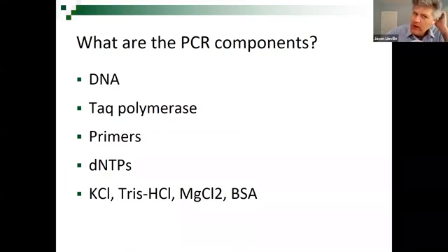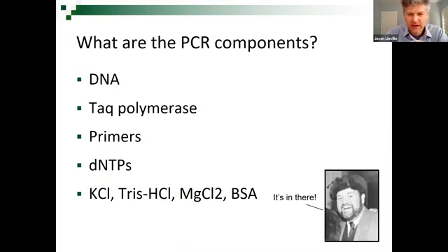So we already went over a couple of these slides right before spring break in this class. We went over what the 4 PCR components are, and then I mentioned with this slide, there's also a couple extra things in there to get the ionic and the pH right, but who cares about that?